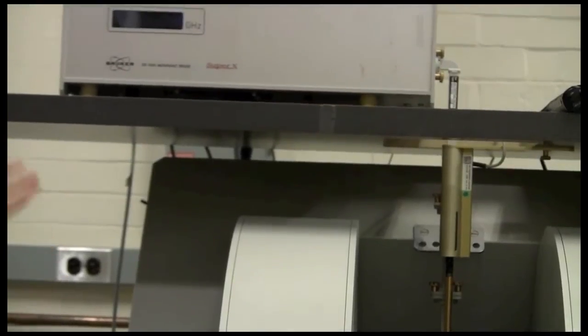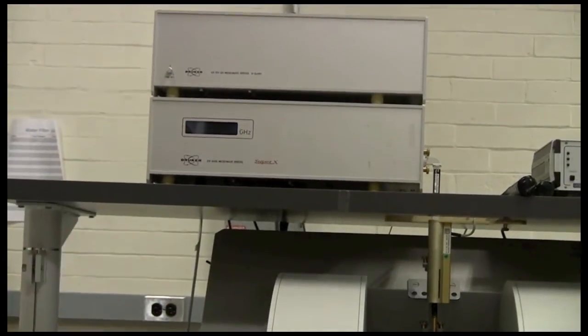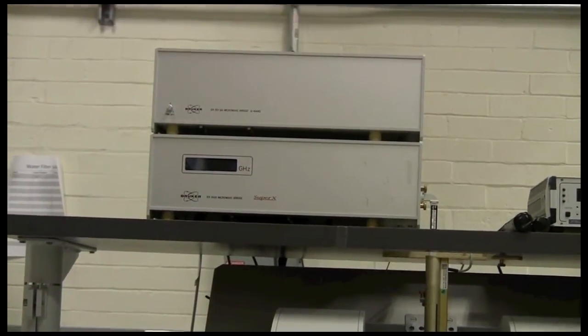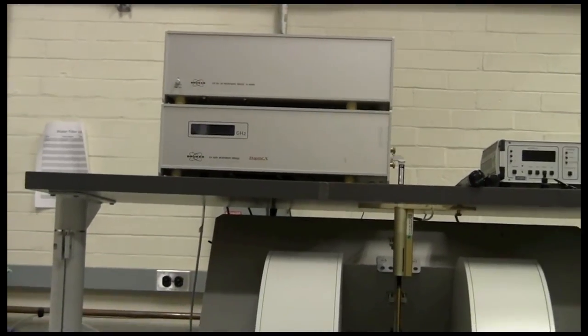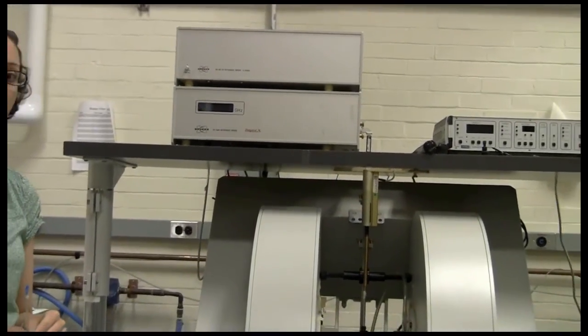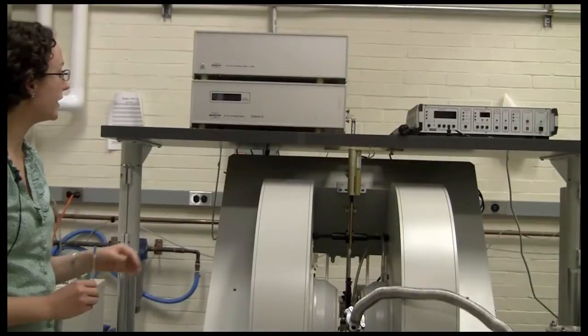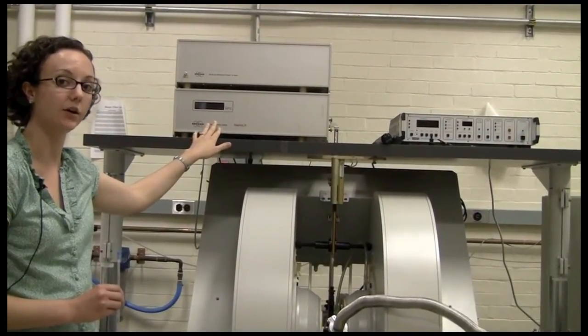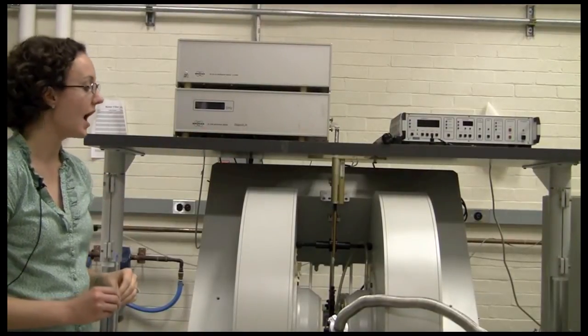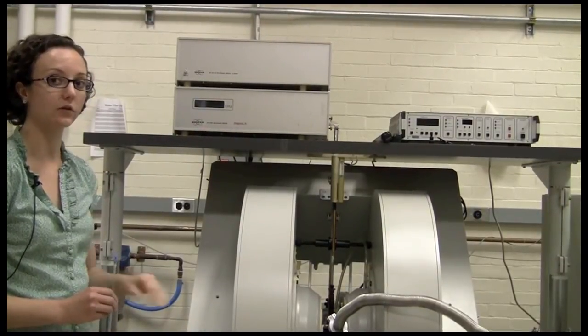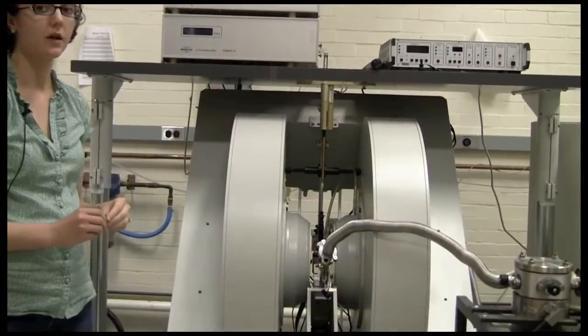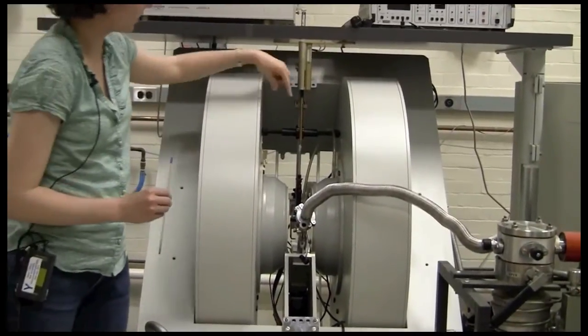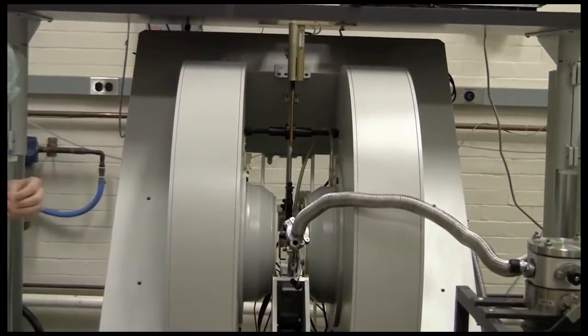We measure the EPR spectrum using our EPR spectrometer. EPR is a magnetic resonance technique, which means we need both a magnetic field and an electromagnetic frequency. For EPR spectroscopy, we fix the electromagnetic frequency around 9 gigahertz, which is in the microwave region, and then we scan the magnetic field using our electromagnet here with measuring the sample in the center of the magnetic field.